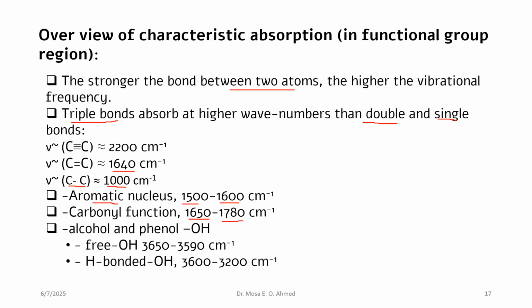Alcohol groups and phenol hydroxy group: the free hydroxy group has a wave number from 3650 to 3590, while the bonded hydroxyl group has a wave number from 3600 to 3200 centimeter minus 1.